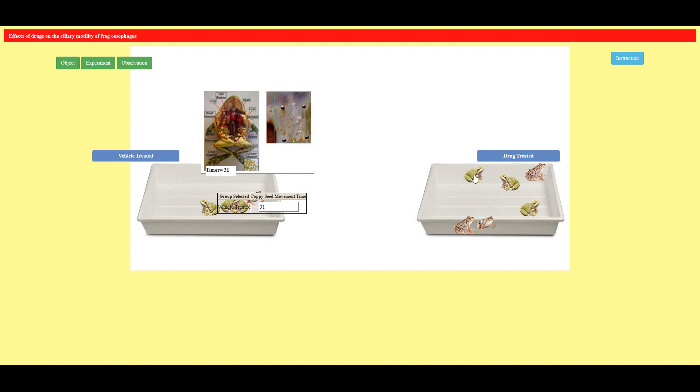Next I'm selecting a drug treated frog. So see here it has been drug treated. Let me see the time it takes by the poppy seed.